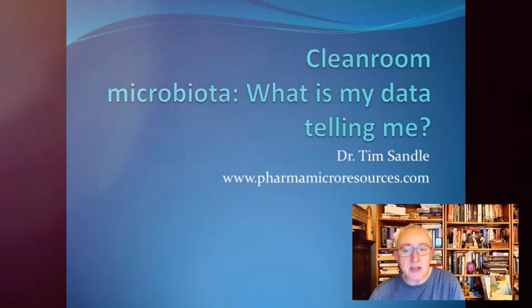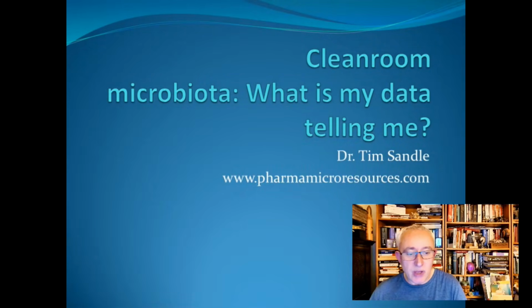So I'm here virtually and I'm going to be presenting on cleanroom microorganisms and the importance of identification and of screening and characterizing and trending microorganisms in general.